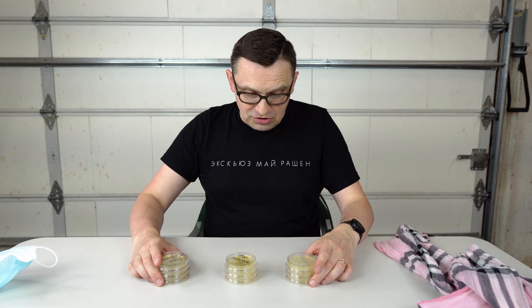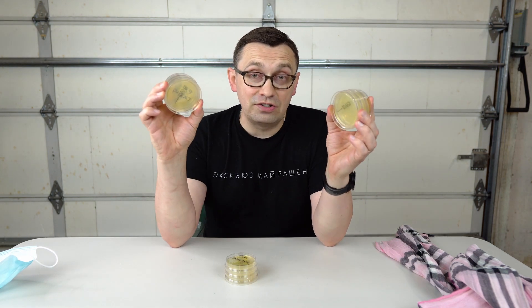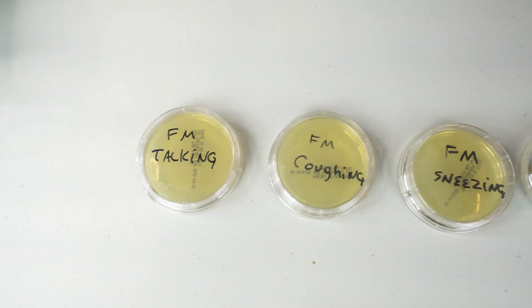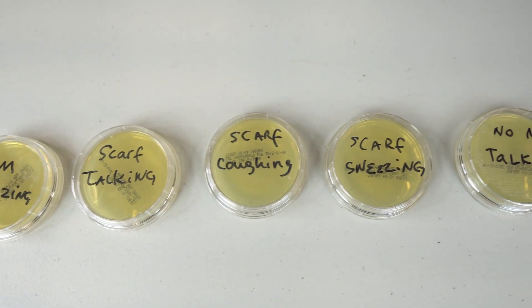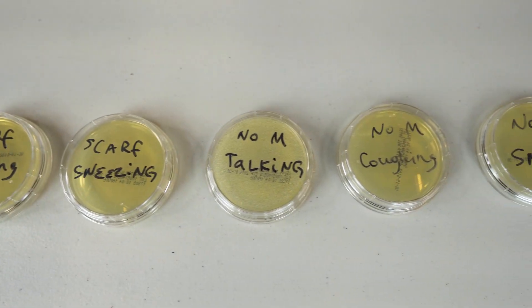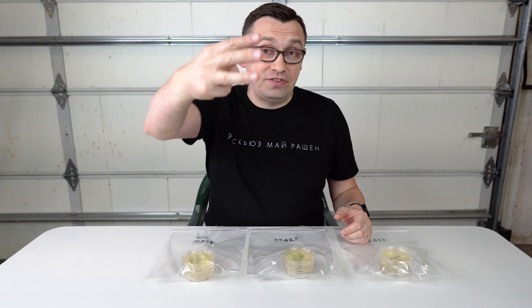I'm going to mark all these petri dishes so I know which one is which. Then I'm going to put them into the incubator and we'll come back and see what the results would be. I had to keep all of them in the incubator for three days.